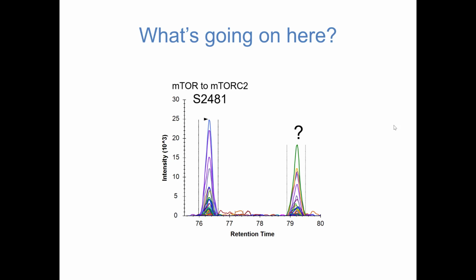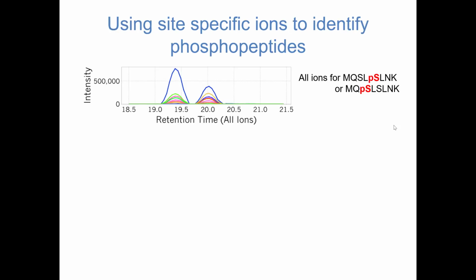So this particular peptide has 5 different serine, threonine, and tyrosine acceptors. And it's clearly phosphorylated at multiple places in this particular experiment. And so we end up having to make a call in situations like this about what's actually going on. Let me show you what this means. For example, I've got this peptide here where I see phosphorylation at one site and phosphorylation at another site, 2 different serines. Well, if I look at all the fragment ions associated with these, I actually see a nice trace there, indicating both forms are present.